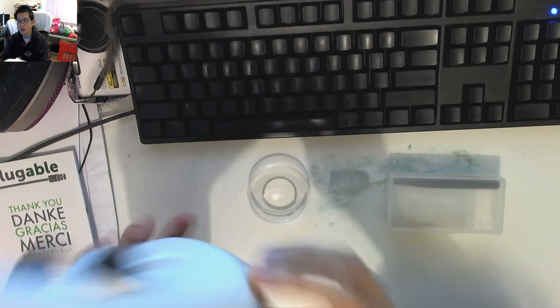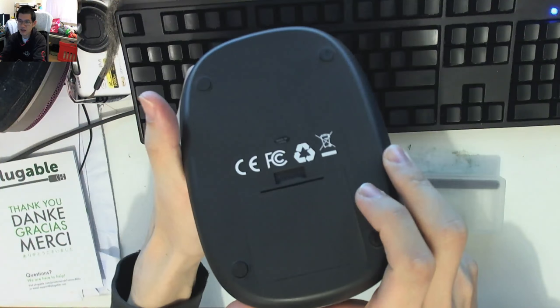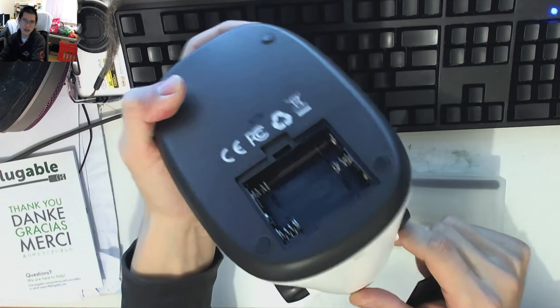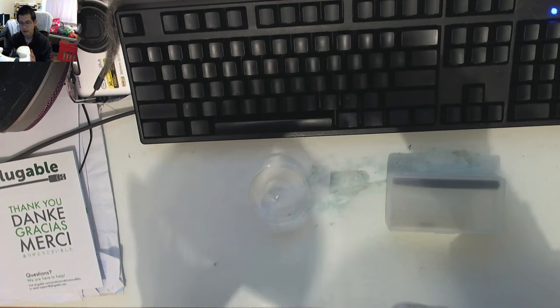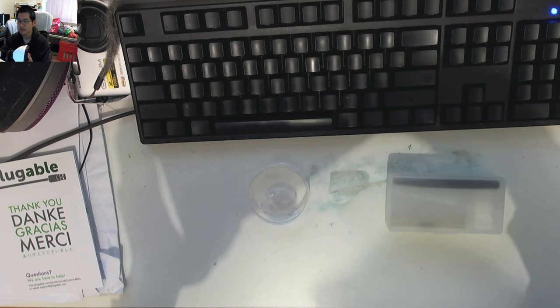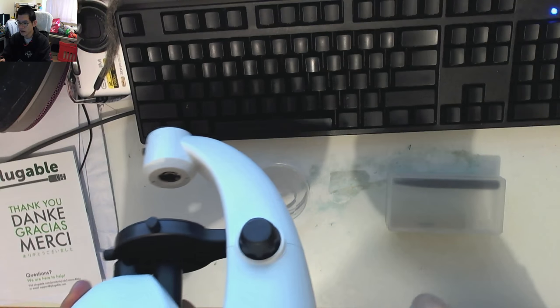We've got our USB connection at the back — standard Mini-B by the looks of it. What's really interesting is there's actually a compartment down here and if I pop that open it will take batteries. So when they talk about being able to use this without a computer because it's got an optical eyepiece — at least it's got a battery compartment so if you want to run off batteries to power it, that would be ideal.